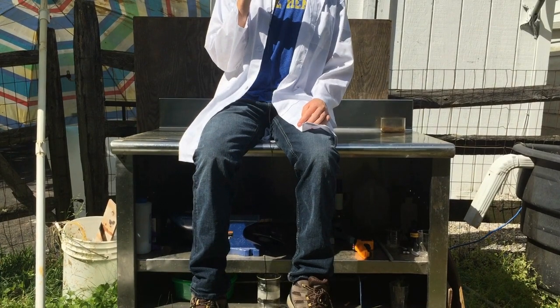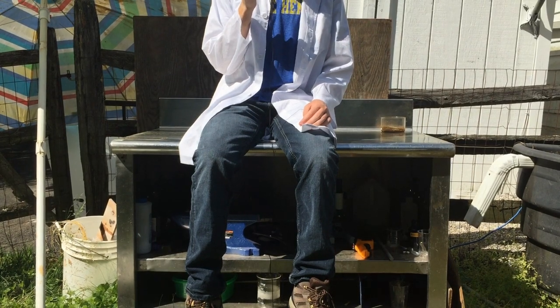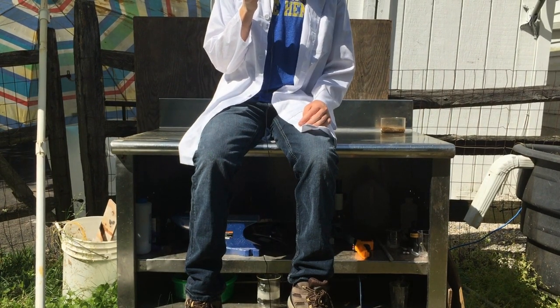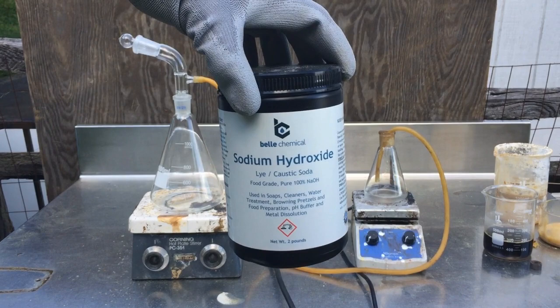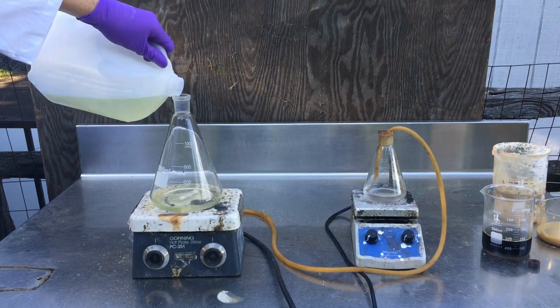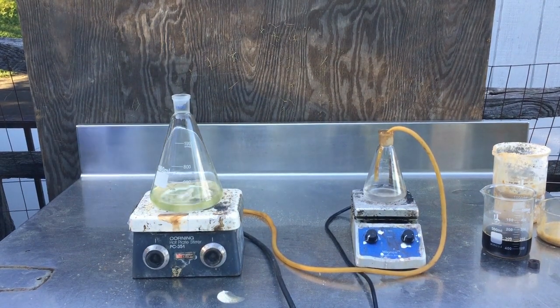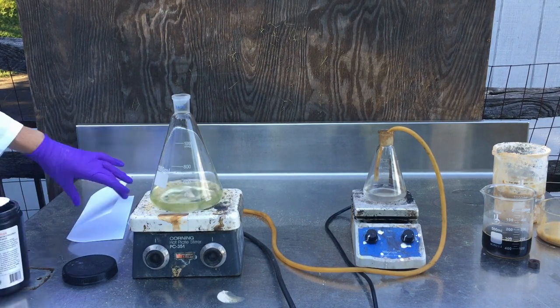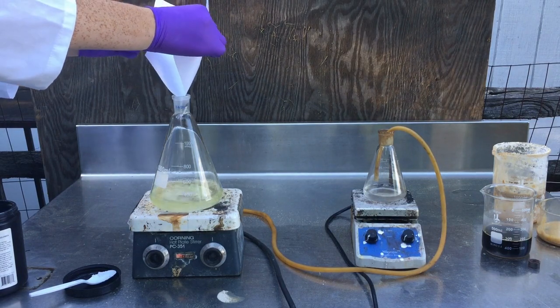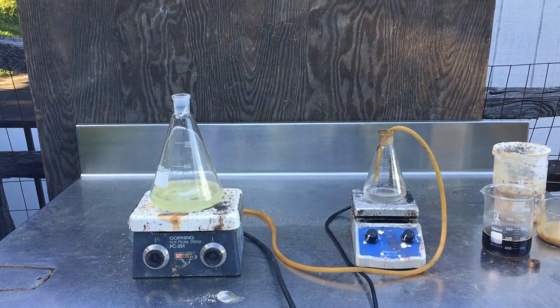Now we have our concentrated pee — about 300 milliliters of it. In the next step we are going to question our life choices. What led us here? Why did we boil pee? Why do we need boiled pee and what are we going to do with it? While we ponder these questions, we prepare a concentrated sodium hydroxide solution in a large Erlenmeyer flask. This can be of arbitrary quantity — I really don't know how much urea is in the urine I used, so we're basically throwing a random amount of sodium hydroxide into water and hoping it's concentrated enough to react with the urea at a high temperature.